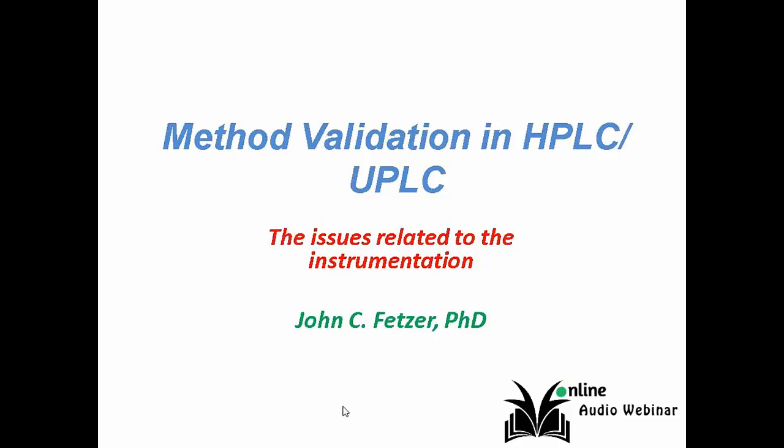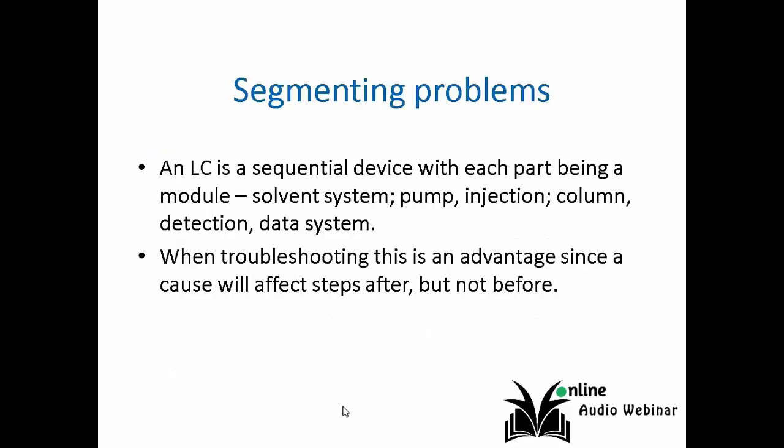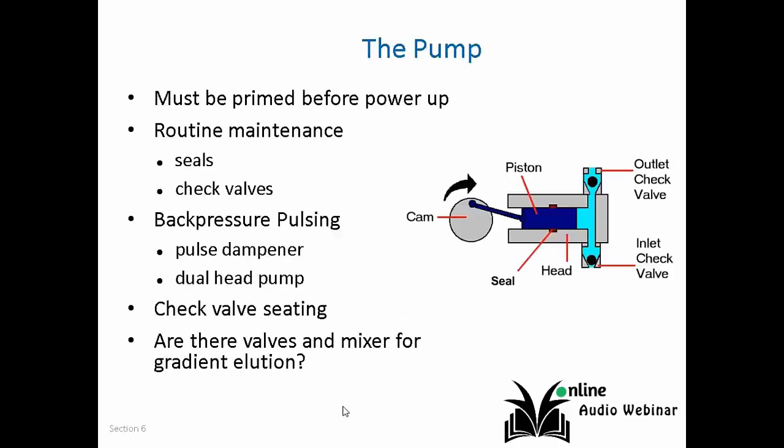This is a webinar on issues in method validation related to instrumentation and operational issues. Schematic of a generic liquid chromatography system. And this is just a little verbiage to describe that, segmenting the problem. Solvent problems are an area that's often overlooked.